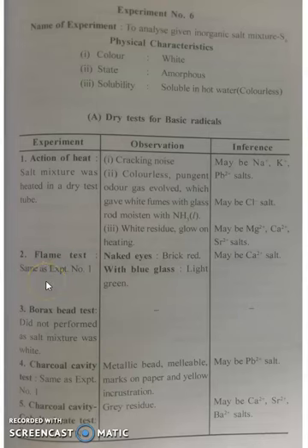Again, you perform the flame test: check with the naked eye, brick red, and with the blue glass, light green, maybe calcium 2+ salt presence. Then borax bead test was not performed as the salt mixture was white. So leave this. Then again you have to do a further experiment, charcoal cavity test.